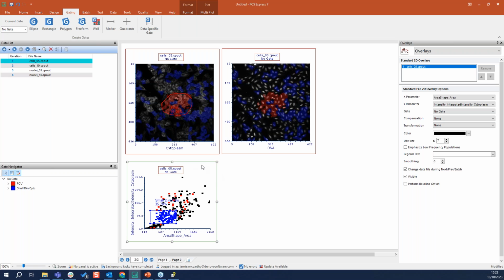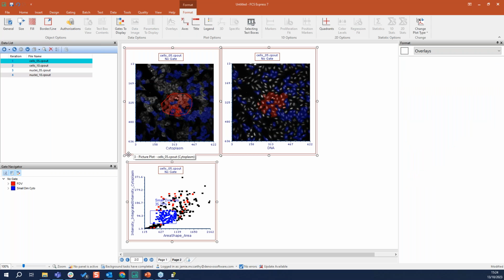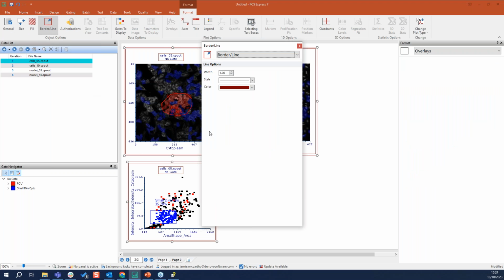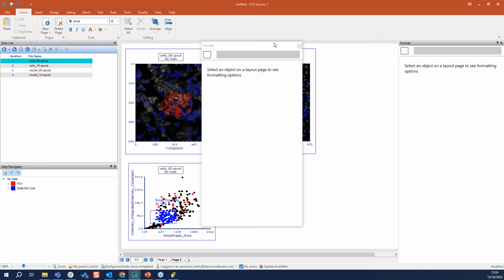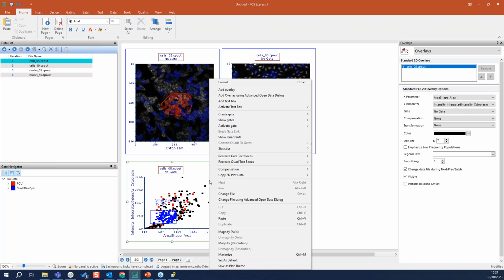Now we've formatted a few things, where we've been changing how we like dot sizes to look. For example, we could go and format the overlay. If we maybe didn't like this brown, we wanted it to look all blue around the edge, something like that, you can come in here and make all these formatting choices. And if you want every time I make a plot, I want these format choices to be remembered, you can right click and set as default.